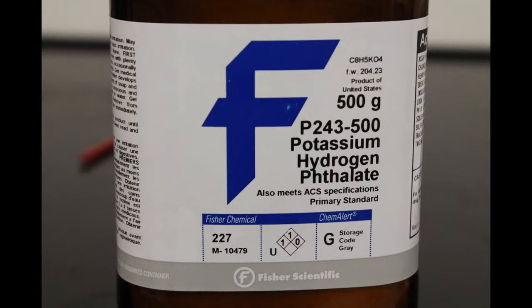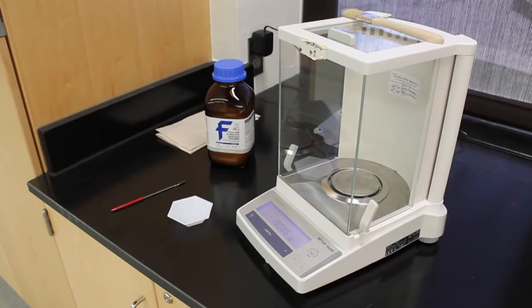Now we are ready to find the mass of our KHP. KHP stands for potassium hydrogen phthalate and will react with NaOH in a 1:1 mole ratio. Note the formula weight of KHP here on the bottle. You will need this mass for your calculations as well.